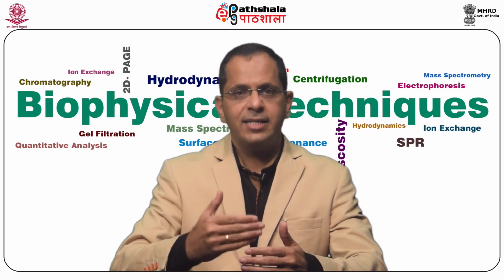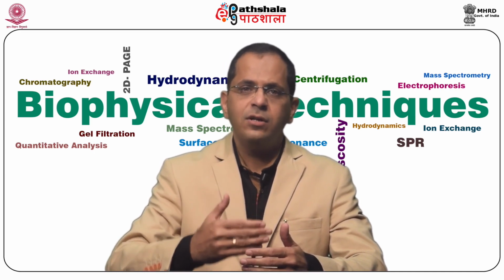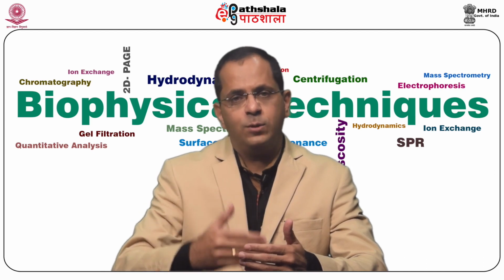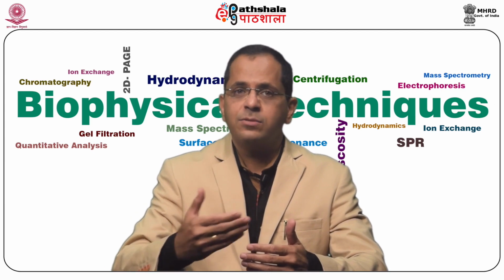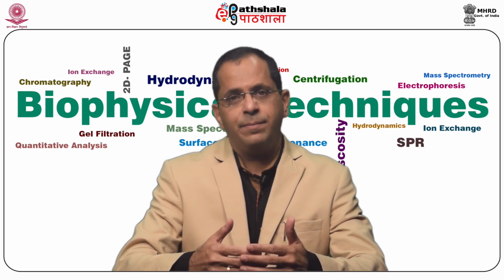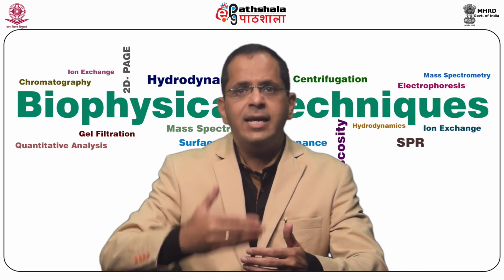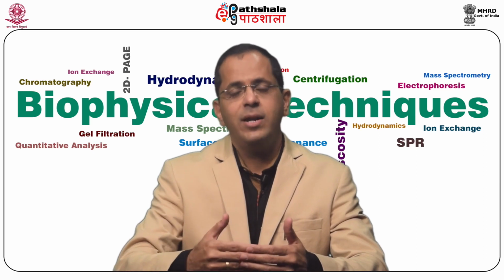The matrix is electrically neutral. The presence of fixed charged groups can cause the flow of water towards one or the other electrode, and usually this being the cathode. This particular phenomenon is called electroendosmosis and markedly decreases the resolution or the separation. Generally, APS and TEMED are used at approximately equimolar concentration in the range of 1 to 10 millimolar.